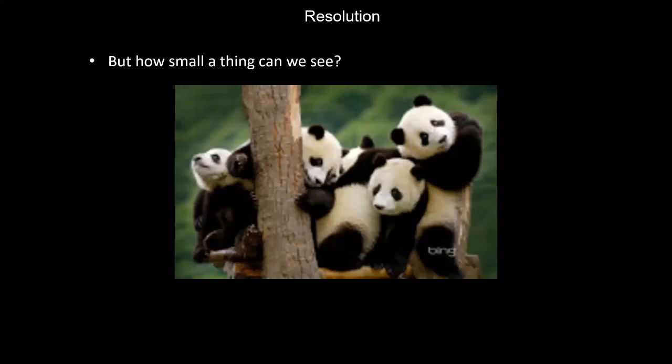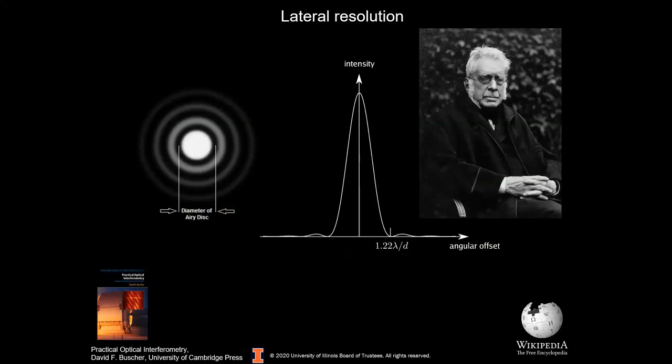Only if we increase our resolution can we get a better understanding of the objects that are being imaged. The main factor that limits how fine a structure we can resolve from our sample using light is that light is an electromagnetic wave, and as such, it diffracts. When you focus the light as tightly as you can, what you get is a diffraction pattern. For the case of a point light source, the shape that you get is that of concentric circles, which we call the Airy pattern, in honor of George Biddell Airy, a mathematician and astronomer who explained this pattern theoretically.